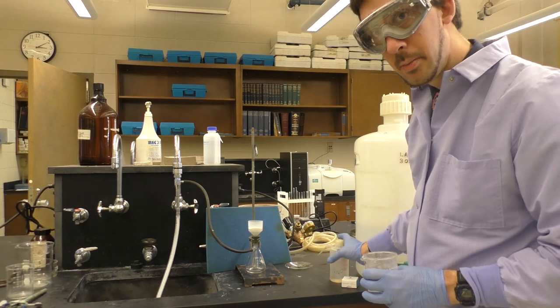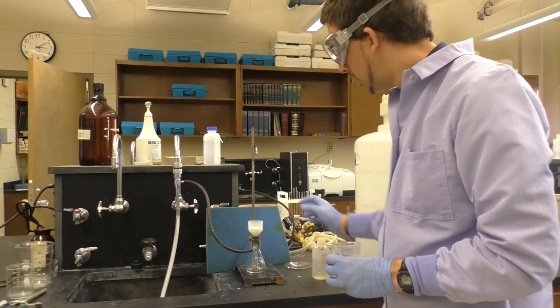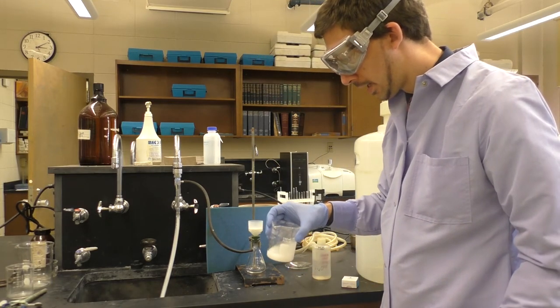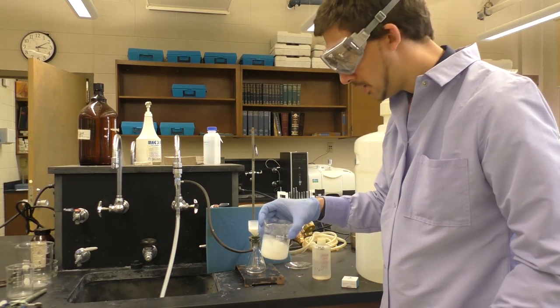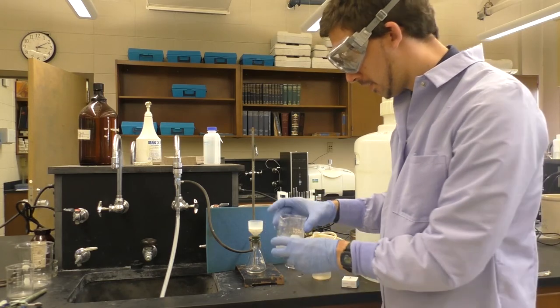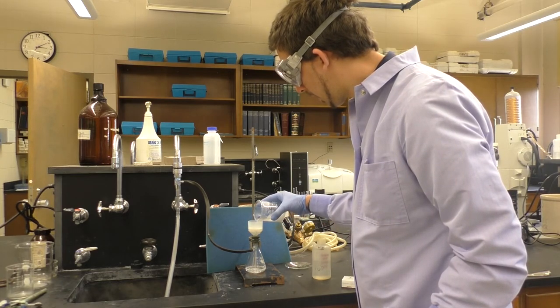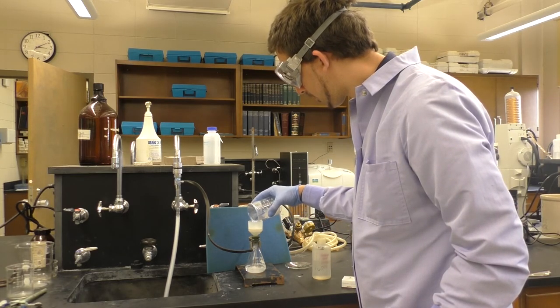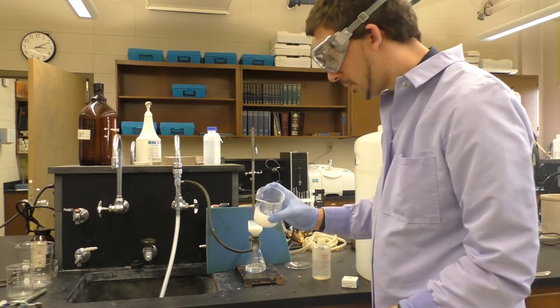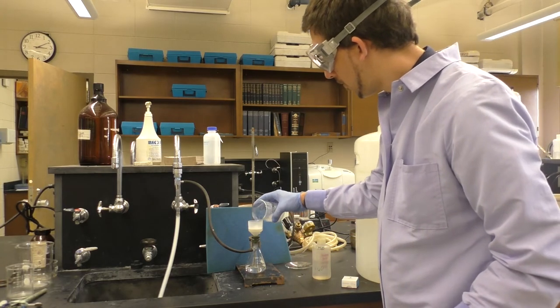I've got a piece of filter paper in here already. I'll wet that, make sure that adheres to the filter very well, and then swirl this up, make sure we can get those crystals suspended. And then collect those by filtering down through. A lot of the material stayed behind. I'll pour that forward.